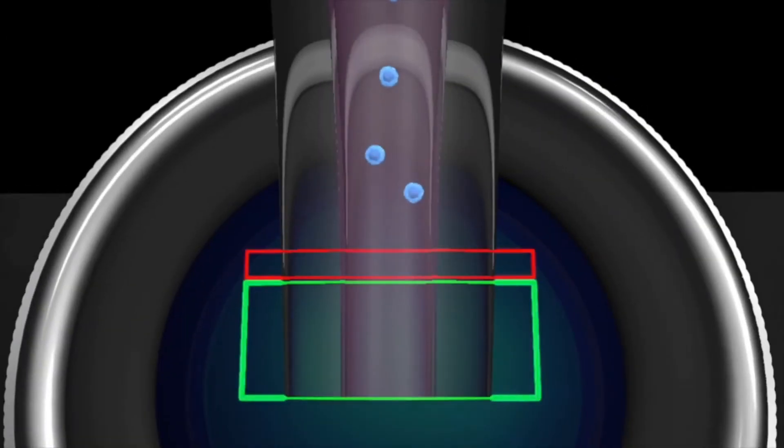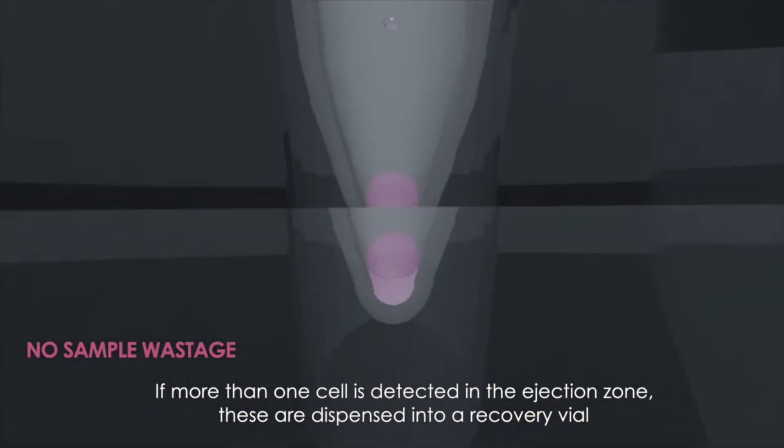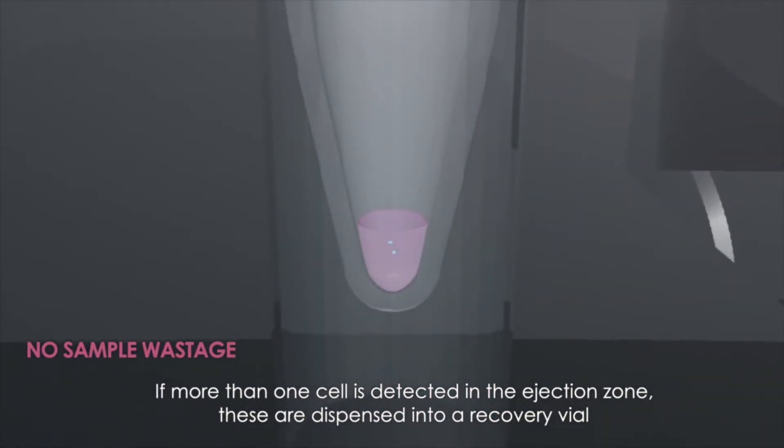Empty droplets, droplets containing multiple cells including cell aggregates, or even debris that do not meet isolation criteria are sent to a recovery tube where they can be recycled or disposed of.